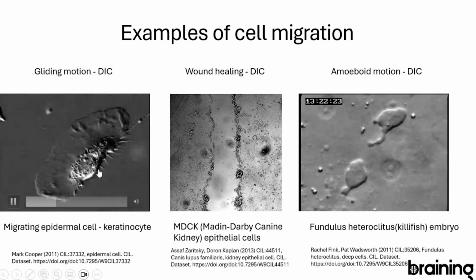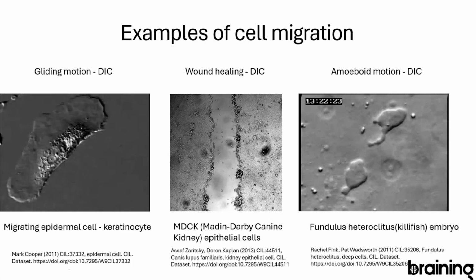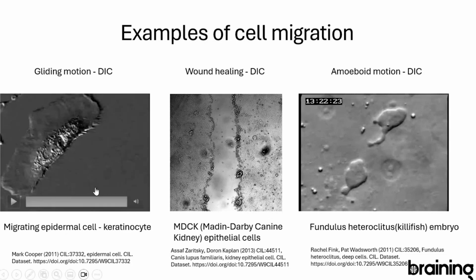You see how nice the movement of this cell is here. The movement is so fast that basically when you are patient, you can see this motion with the naked eye. You don't need to record. You see that they are moving pretty fast.